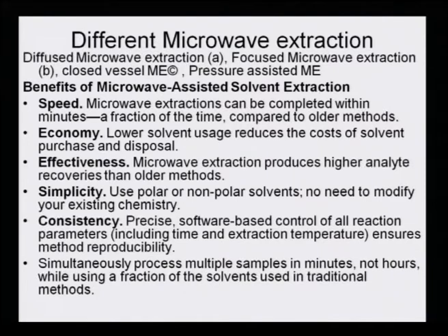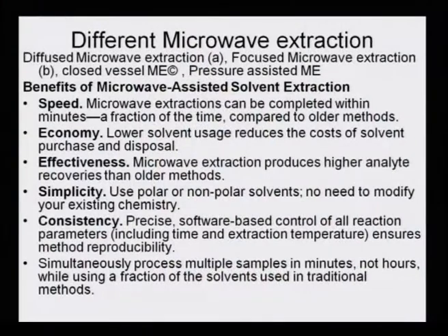As the name suggests, if it is diffuse, that means it is a very general kind of microwave extraction. If it is focused, the microwave energies are particularly focused on a particular point. If it is a closed vessel microwave extraction, the vessel is completely tightly closed, and if it is pressure assisted, that means there is a special pressure acting upon the microwave extraction.